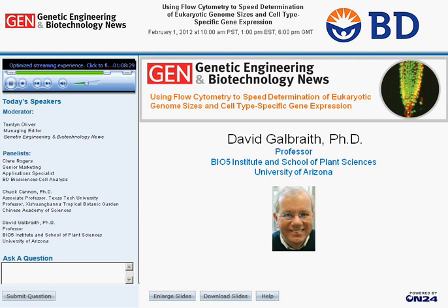On the other hand, if you're doing ploidy screening in thousands of individuals of a single species, then there's no reason that you couldn't crank through. But if you're doing different species, then you're going to run into all sorts of issues that will need resolution, not least of which is the problems that you encountered with secondary products.